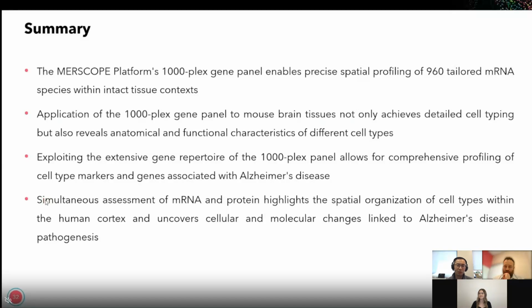So it's really challenging to segment those transcripts distant from the cells. Even with tracing, you can hardly identify the axon or dendrite that corresponds to each cell. There may be some specific labeling methods.